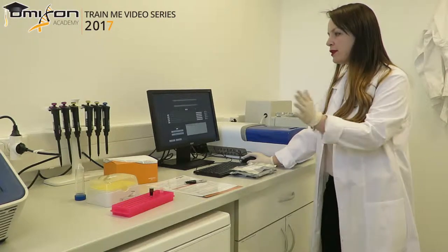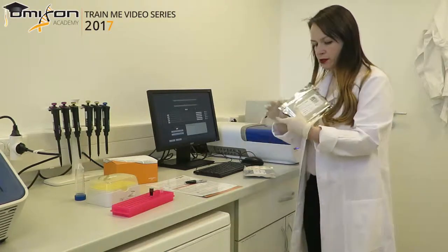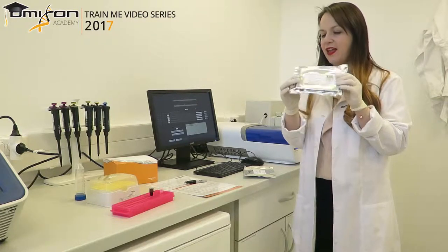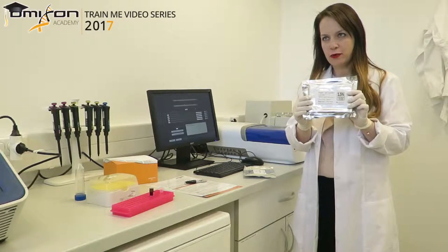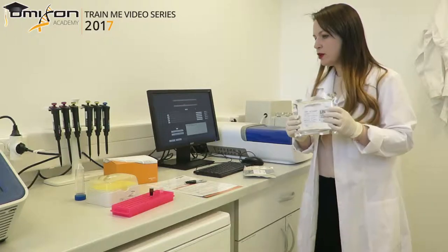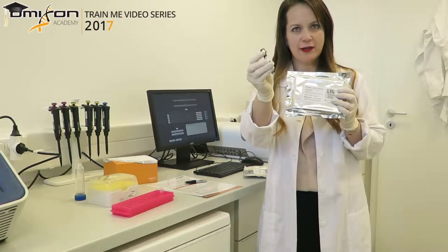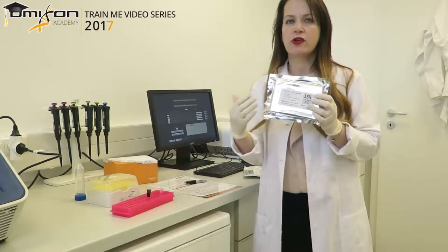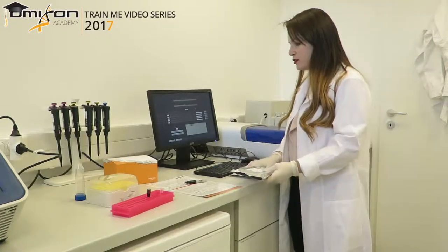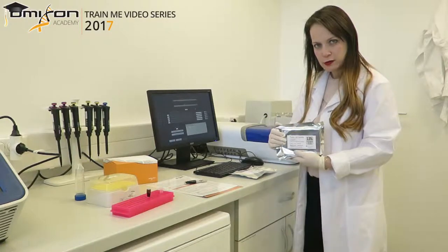We input all of the information that we need. For this process we use the 1.5% dye-free agarose cassettes. These cassettes do not contain any ethidium bromide and are based on fluorescently labeled markers. We use an internal marker that is fluorescently labeled — we mix it with our library and then use only one lane in this cassette.